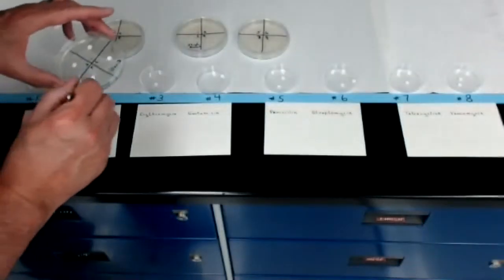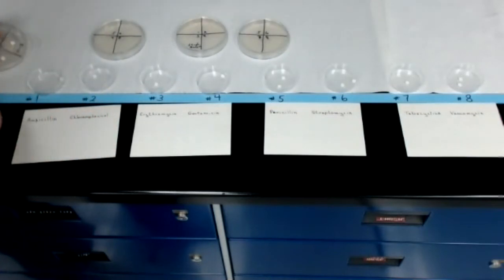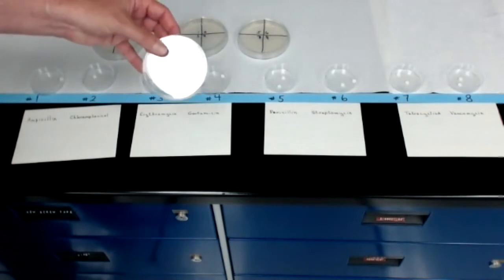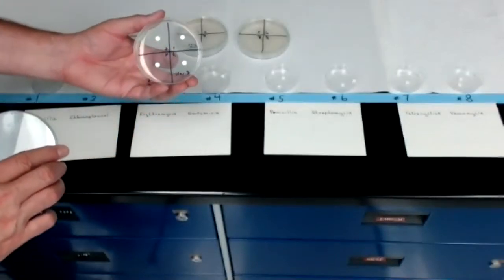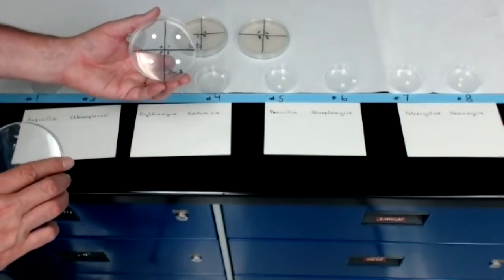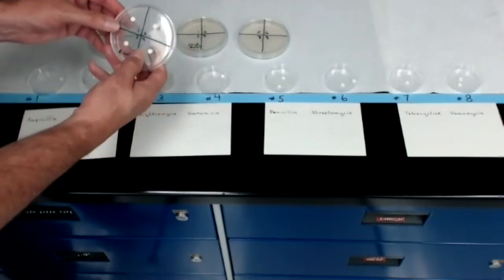Tamp it down, and then replace the cover. So now you can see four discs on the first E. coli plate, quadrants 1, 2, 3, and 4.